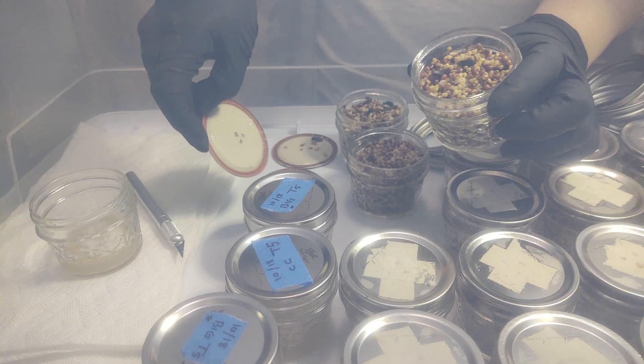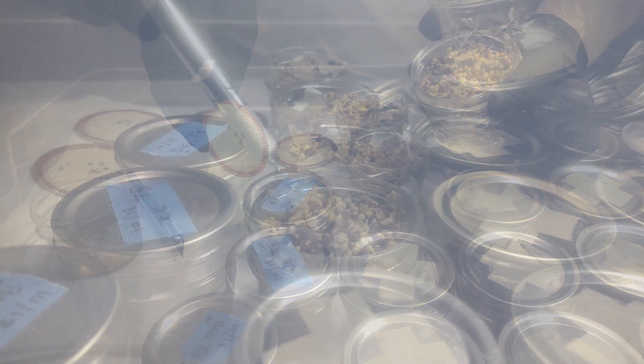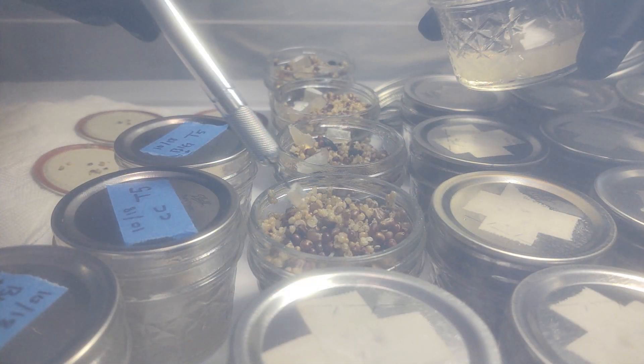Grain spawn can be inoculated using a variety of methods including spores, agar, and liquid cultures.